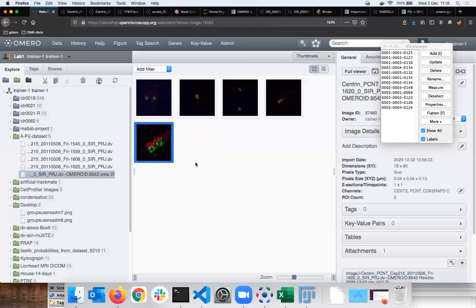Just the sequel to what Jean-Marie told you: the analysis is running where Fiji is, so you have to transfer the data between Fiji and the server. There are several ways you can put the analysis closer to where the data is. I was already highlighting that you can manipulate the place where your Fiji is.